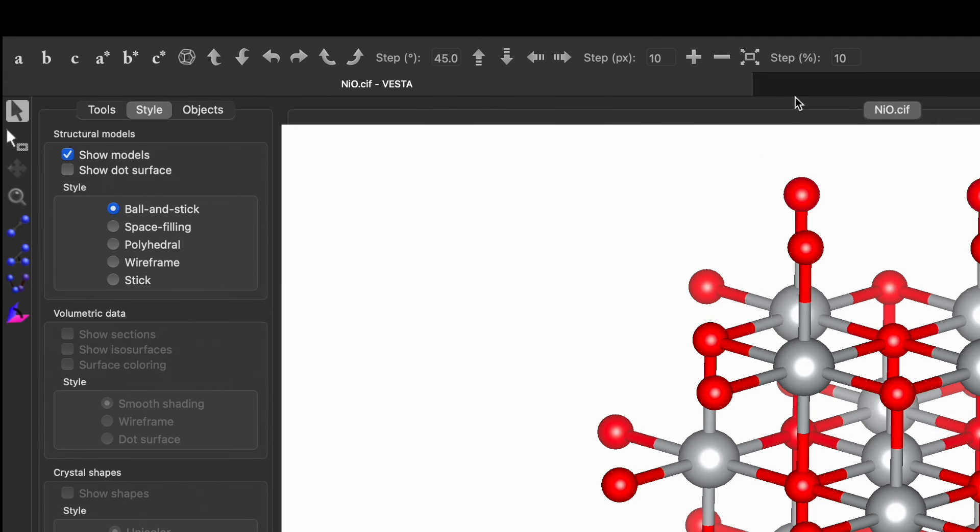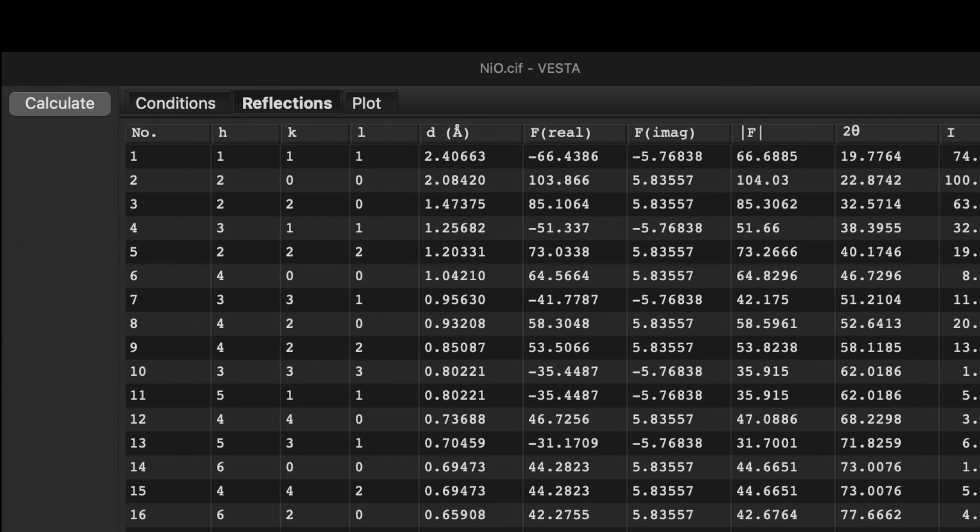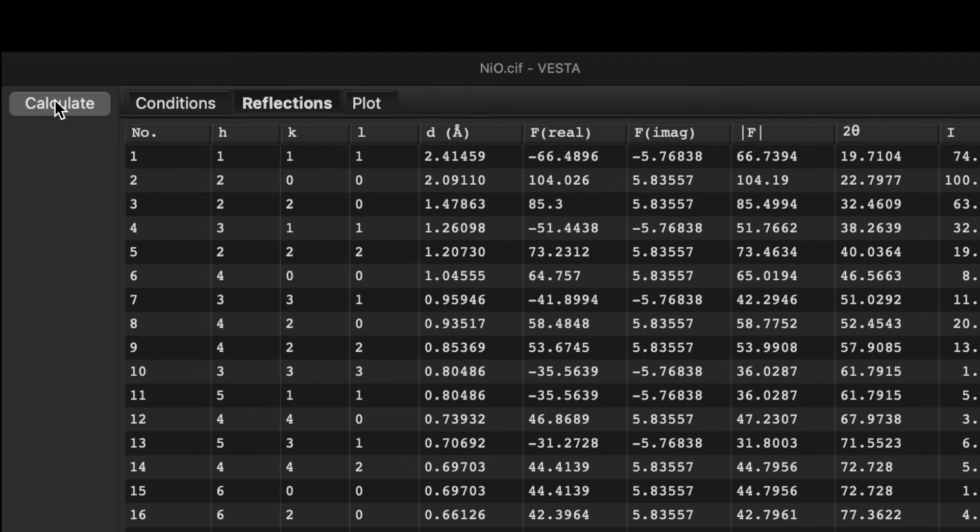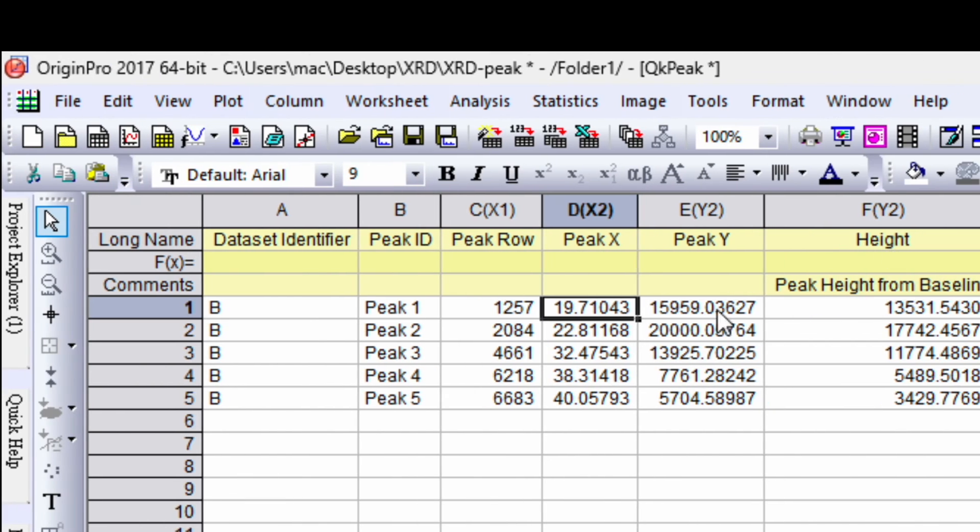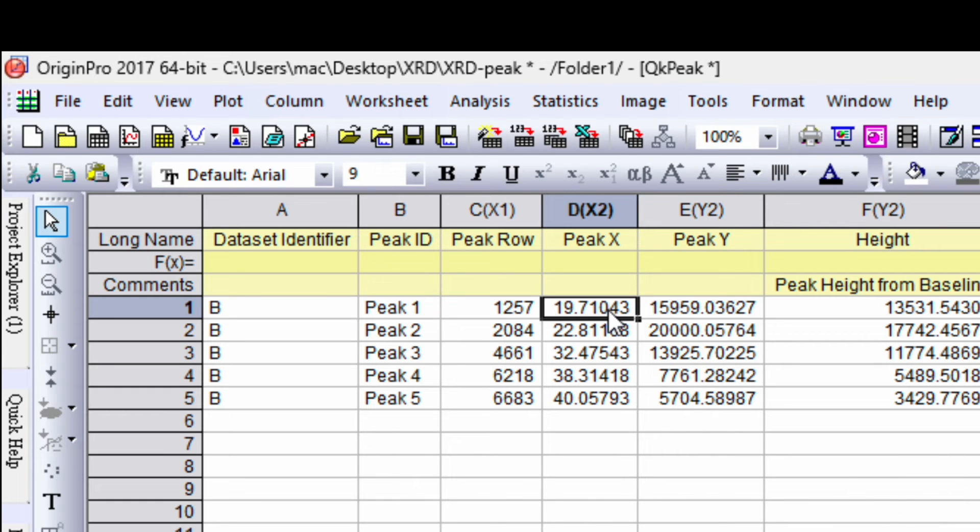After this go to the reflection list and click again on the calculate. So once you click then you will see the change in the number. So now it's become 19.7104 which is pretty close to what we see from the experimental XRD diffractogram.